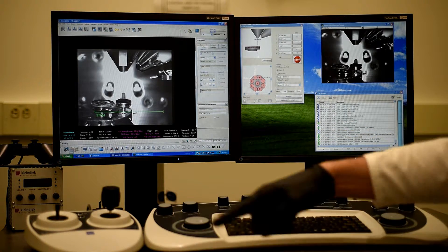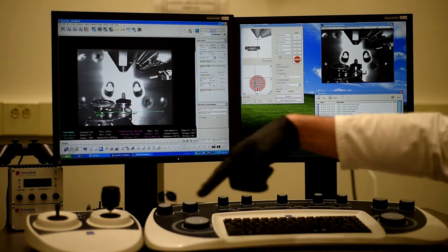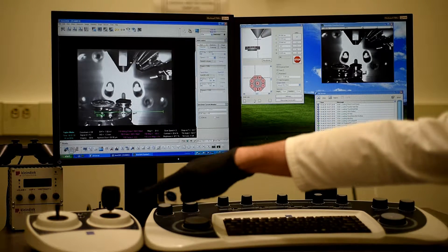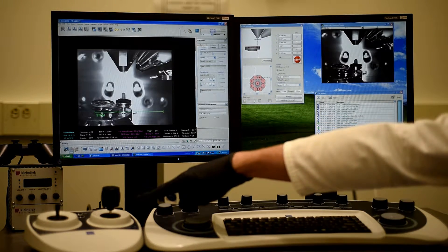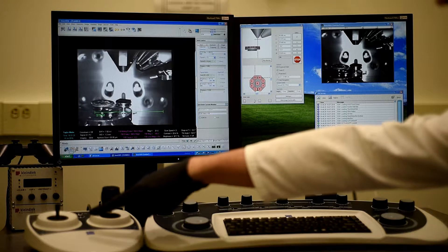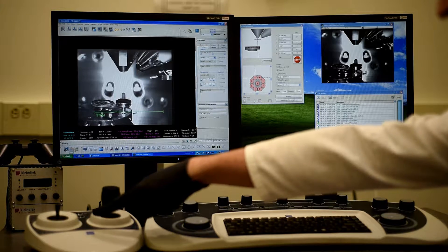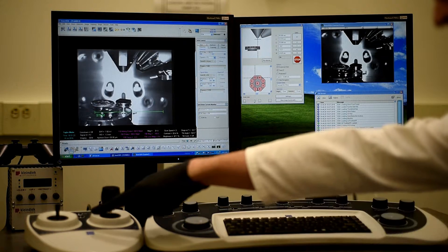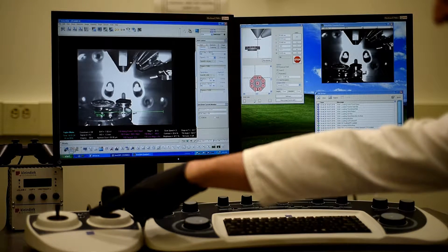The other controller controls the X and Y. And then also the Z, or the working distance, and also the tilt.